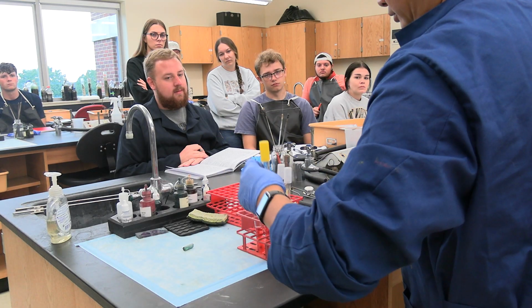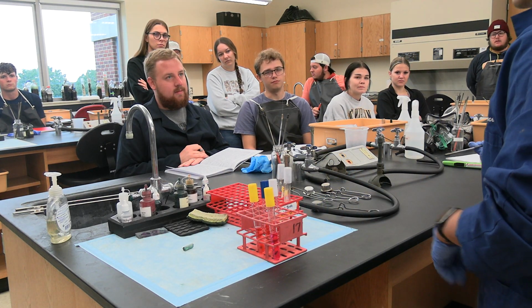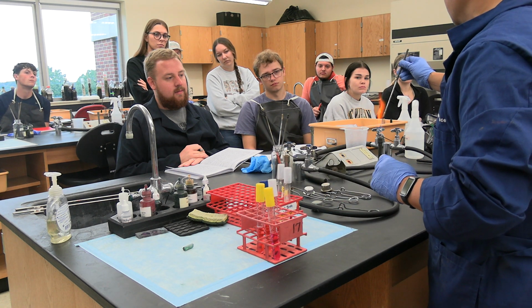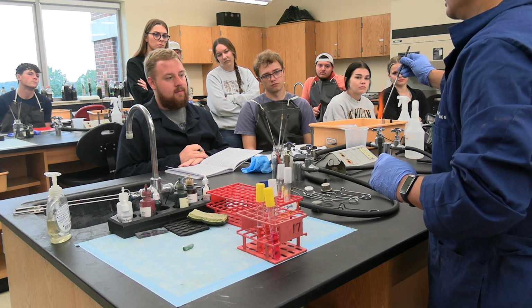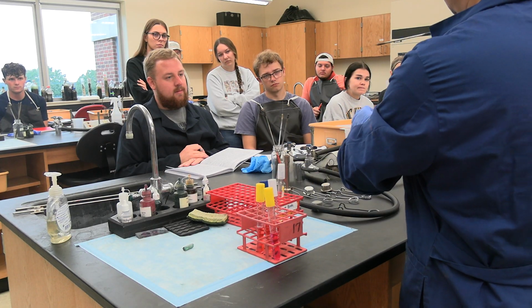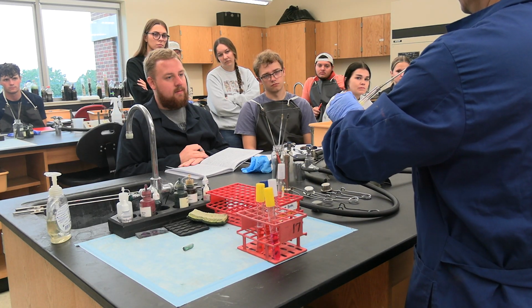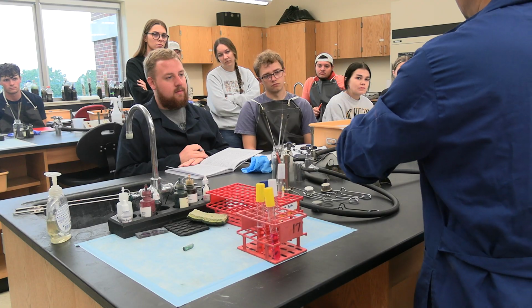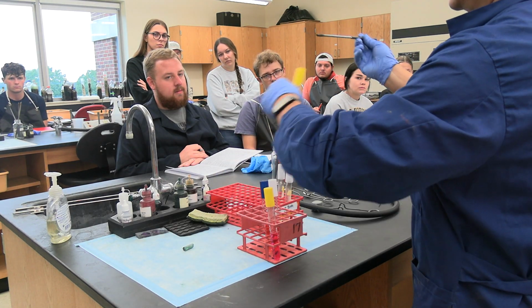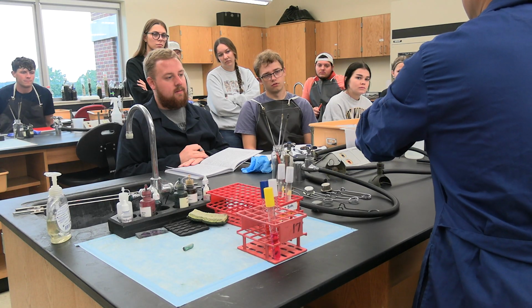Then when you finish, put it here. Second, just to give another example. Flame the loop again, because it's a different reagent. What do we do? Let's say E. coli. Flame the loop, get the bacteria, flame the loop again. Go here. Be careful.